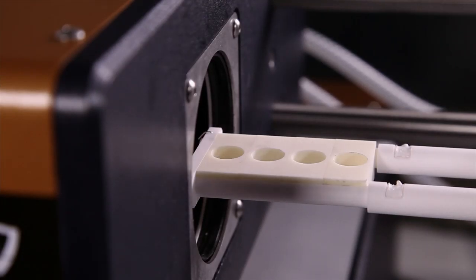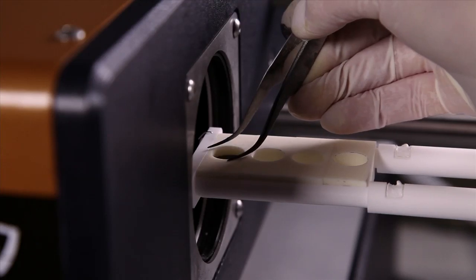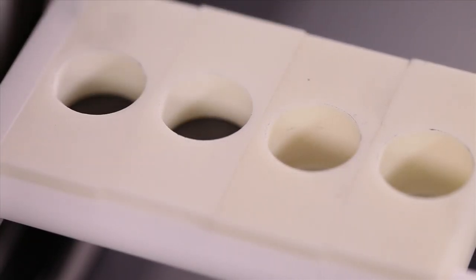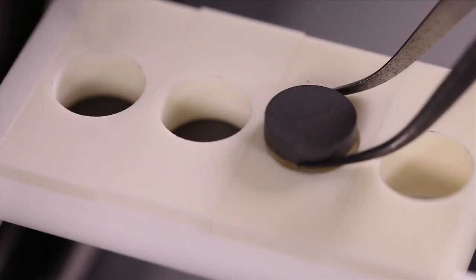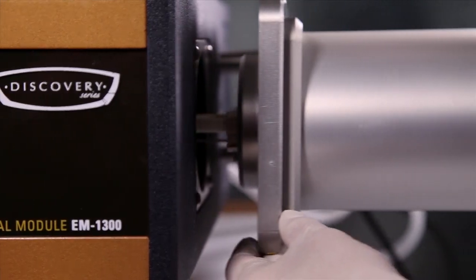After the samples are ready, we can load them into the instrument. We put the reference sample in the first position and the next samples in the other positions. Now you're ready to set up your experiment.